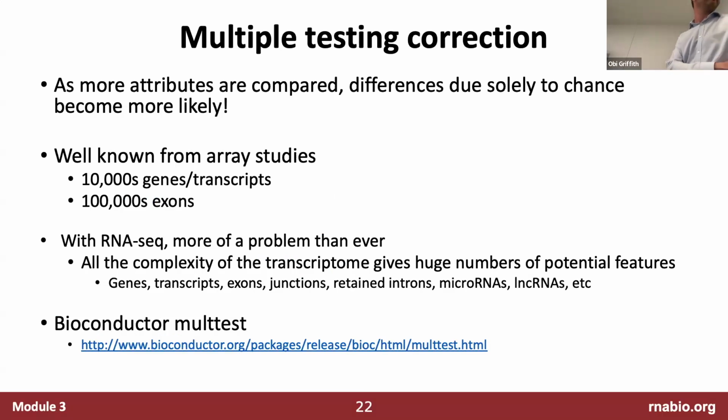A question from the Slack. How do you perform differential analysis with RSEM data, which can be downloaded from sites such as TCGA?